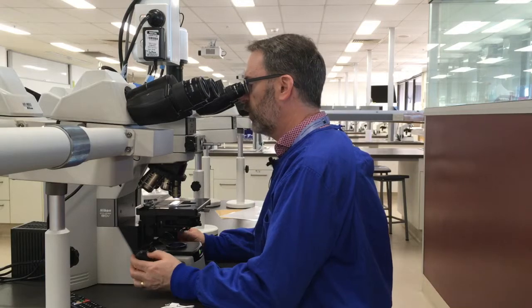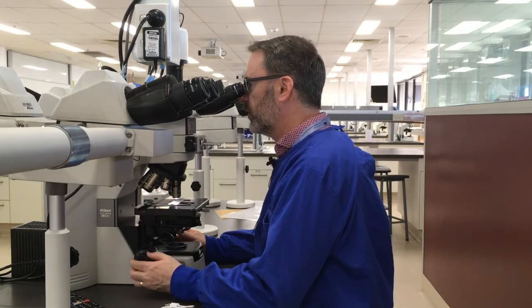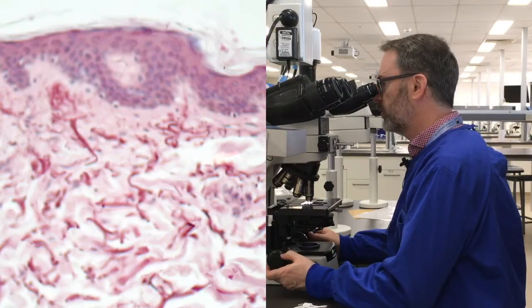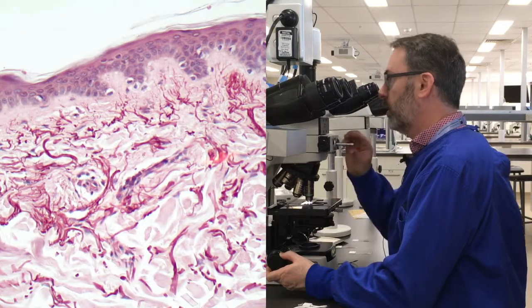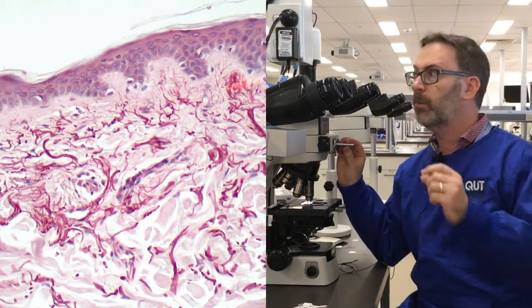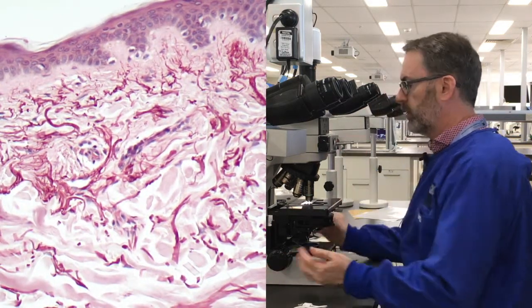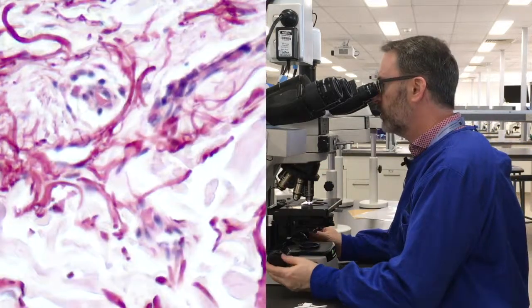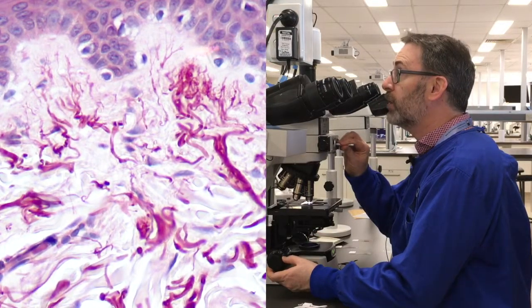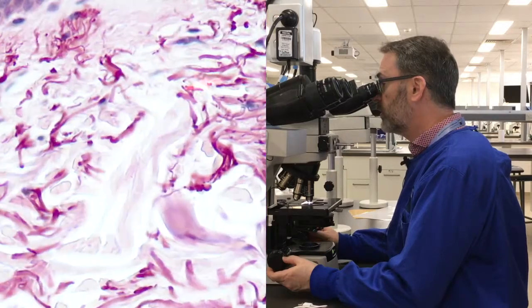Just bringing that into focus — it's a bit upside down, so I'll just turn it around to orientate ourselves. Starting with the epidermis up top, this is at the same 20x power as what we just had. This is a really nice orcein stain that demonstrates how effectively this stain can pick up those very fine elastin fibers. Just going to a higher power because they're so nice — you can see these branching networks of elastin reaching up to the basement membrane.